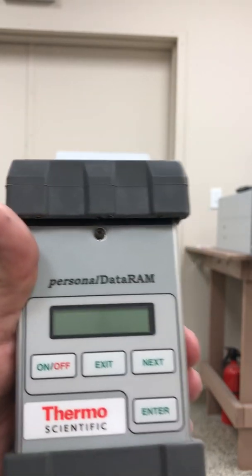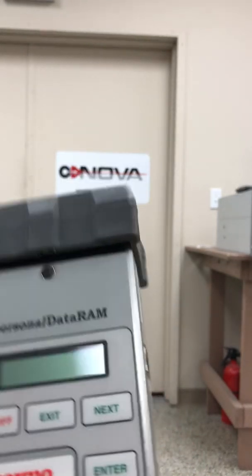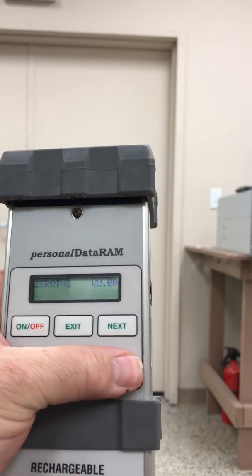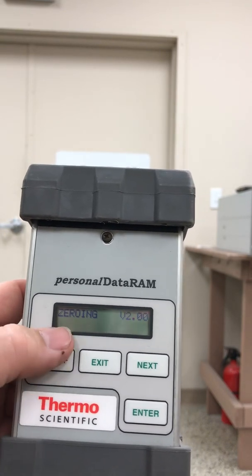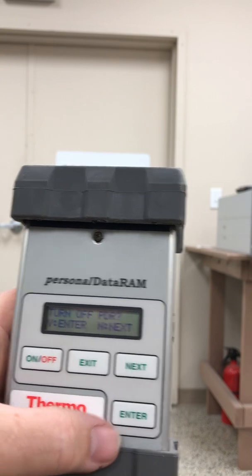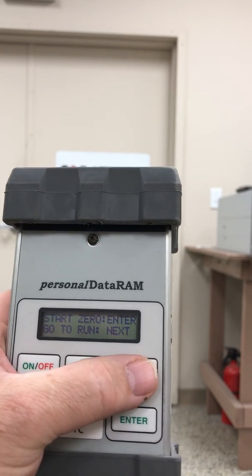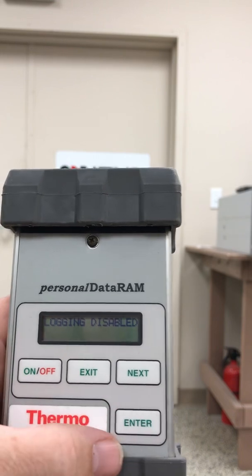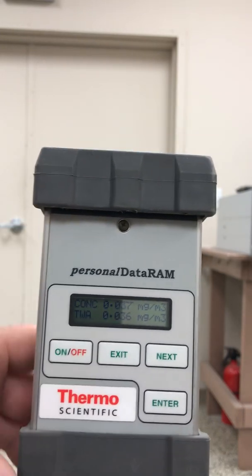Very, very good portable particulate monitor. Plug the power adapter back in for the pack and turn it back on again. Enter, exit — it's going to do the zeroing function when you first turn it on. Start run, enter, and we start sampling right away. Logging disabled. And the concentration and time weighted average again. So that's the PDR-1000AN.